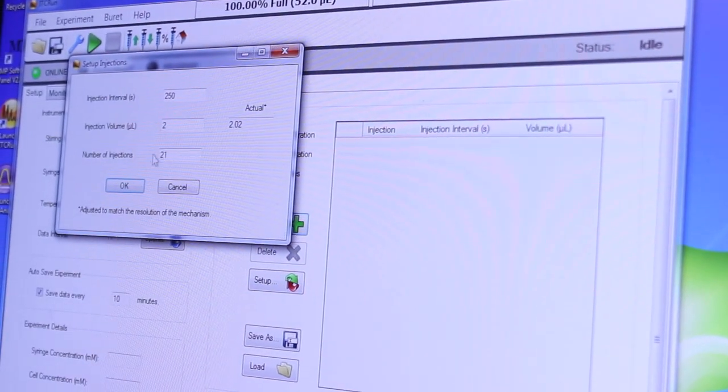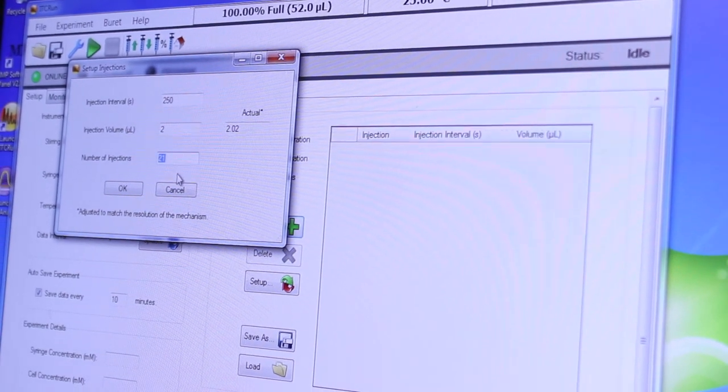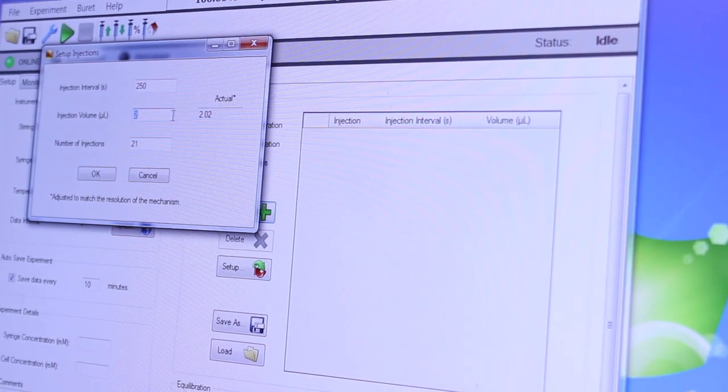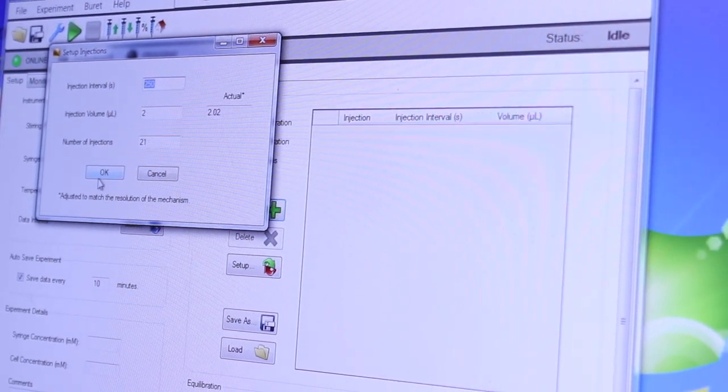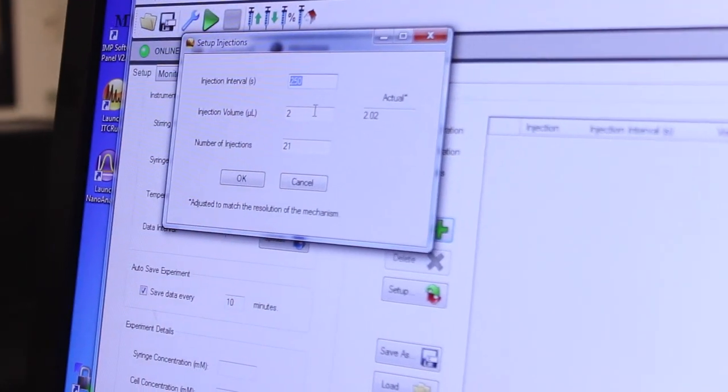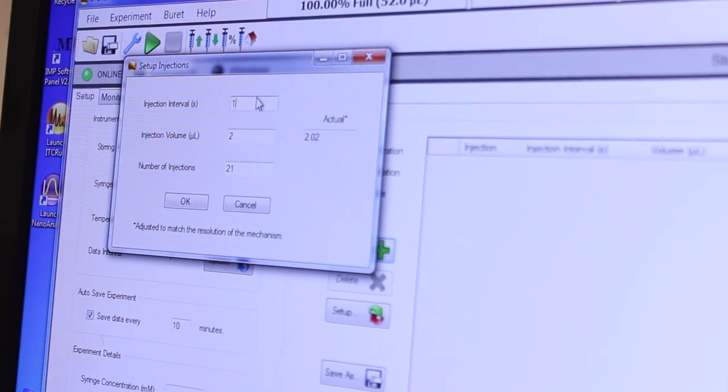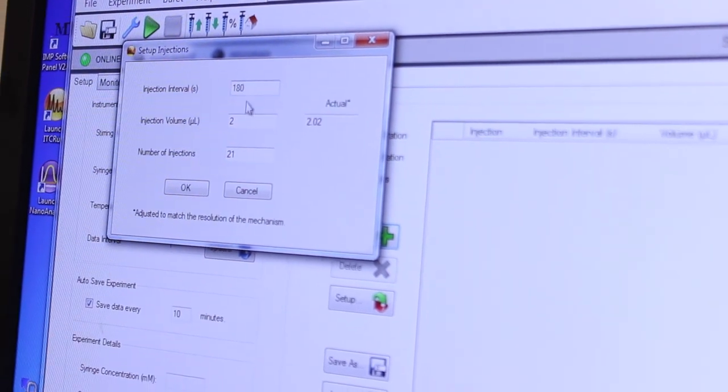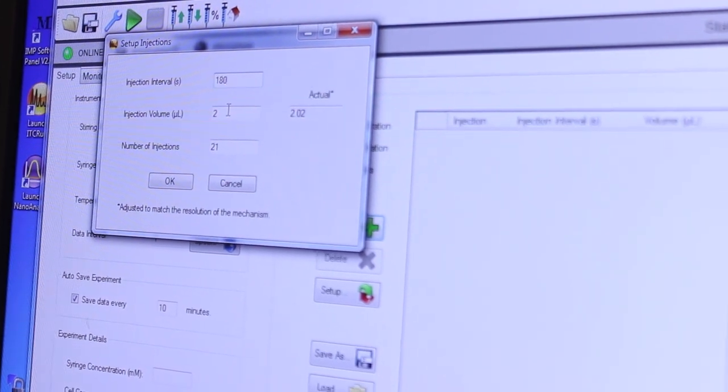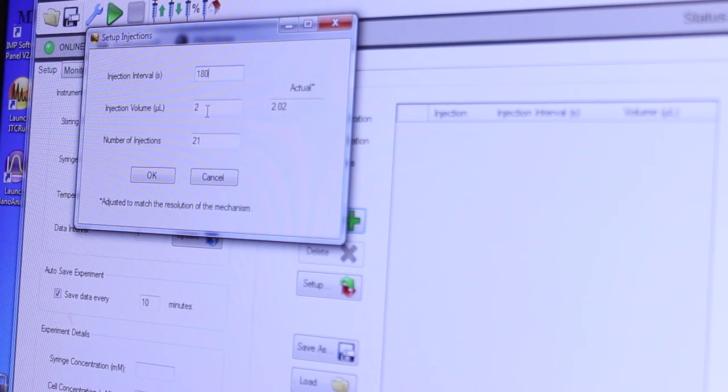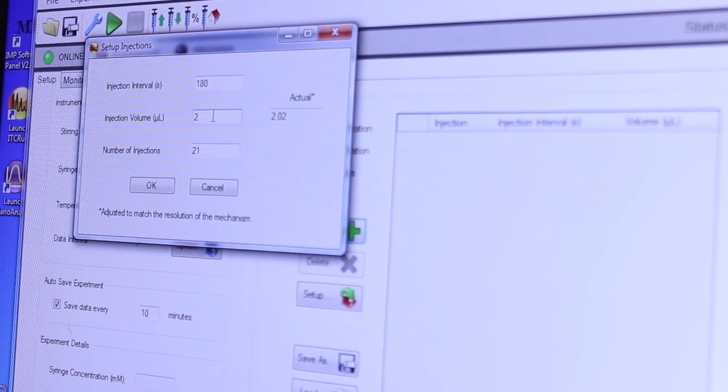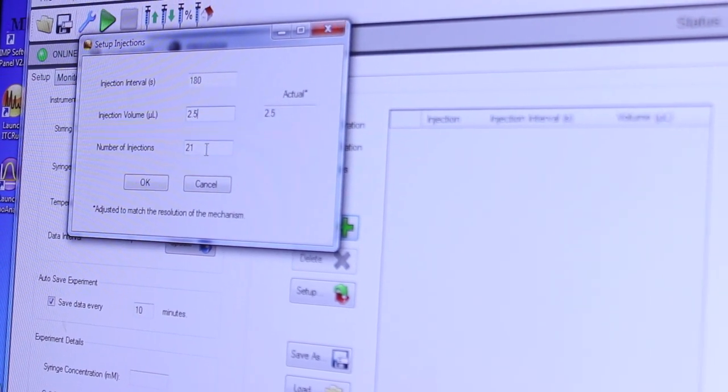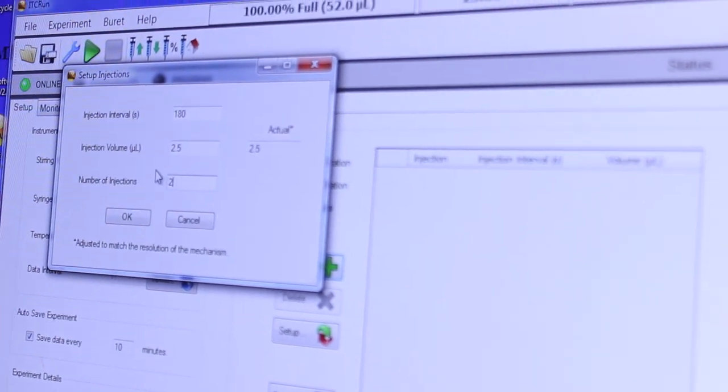Alternately you could click delete to delete all the entries and then click insert and it would allow you to specify a number of injections the volume and the interval so let's for example let's go for 180 seconds with an injection volume of 2.5 microliters and a total number of injections of 20.